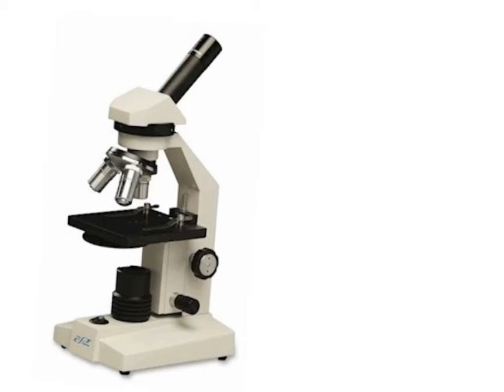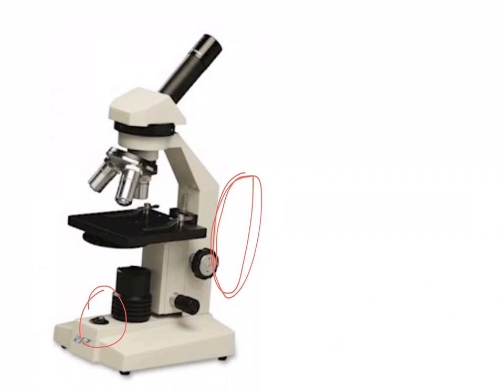Now let's talk about how you're going to use the microscope in this class. Depending upon the day, the microscope may already be set up for you, or you may need to move it. Remember, one hand should be on the arm and the other underneath supporting it as you move it. First, remove the dust cover. Unwind the electrical cord from the prongs in the back and plug it into the power supply. There is a power switch on the front, back, or side that you will need to turn on to activate the light.